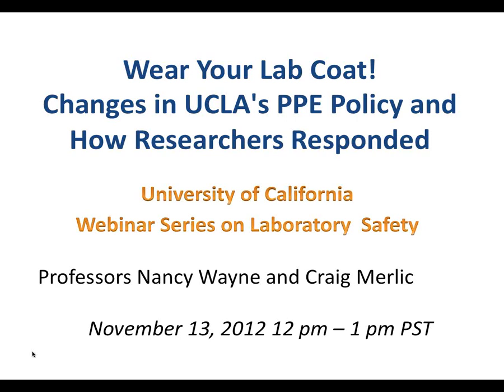I was at a safety conference 2 weeks ago, and one of the key things that came up was that chemists know a lot about the hazards of the materials they're working with. So some of the challenges are educating the non-chemists about the hazards they're encountering with the things that they're using. For example, it was mentioned art. If artists are using solvents, they're highly flammable materials, and they need to take precautions, and maybe they're not so aware because they're not specialists in chemistry. And that goes true for the biomedical and life sciences. We have a lot of chemicals in our lab, and we know what they do in terms of the response of biological systems, but not the impact necessarily that they have on the human doing the research.